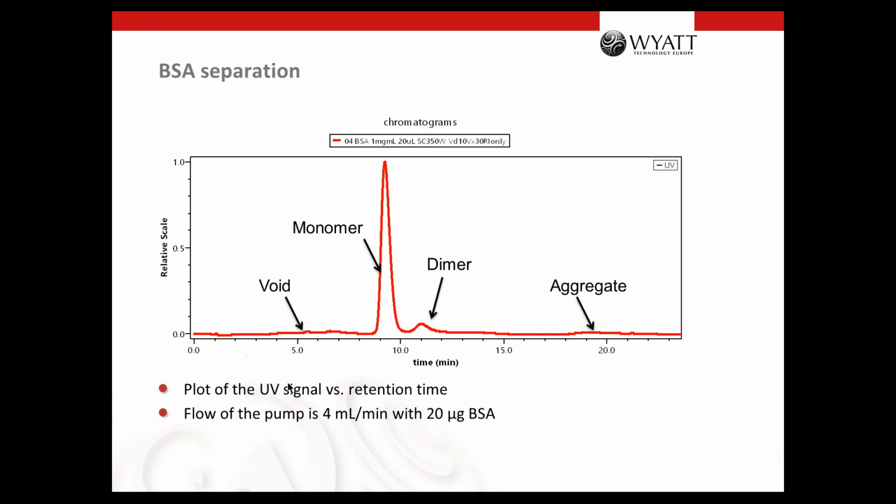And we have again here a pump flow of 4 milliliter per minute. This comes into the channel, and then the FFF splits the flow so that the cross flow is regulated to 3 milliliter per minute, and that means 1 milliliter per minute is left, and this 1 milliliter per minute goes through the channel outlet to the detectors. Here in this example, we injected 20 microgram of the BSA. So that's a quite reasonable amount of sample, which is comparable to an SEC column.